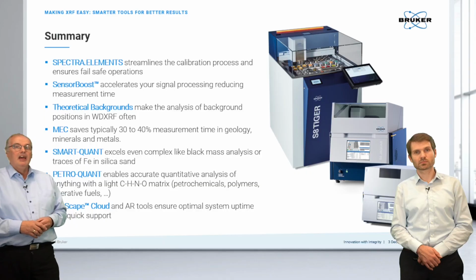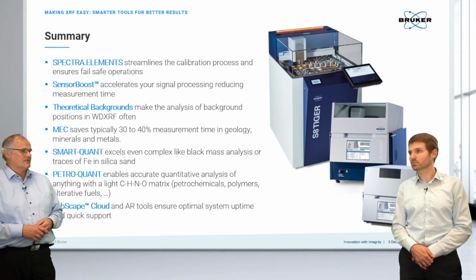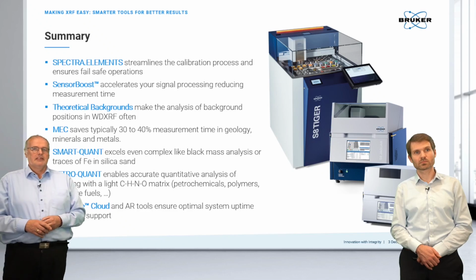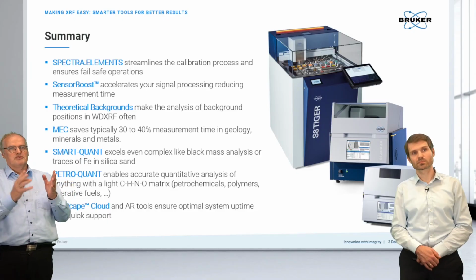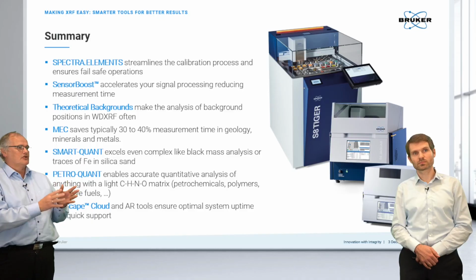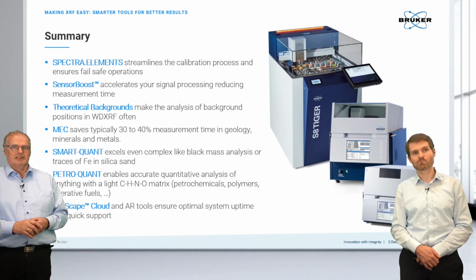The theoretical backgrounds are integrated into the software, and this again helps to speed up the wavelength dispersive instrument. This works for a lot of applications. The multi-element channel was the other choice, to go from a sequential mode into a so-called hybrid mode, having sequential wavelength dispersive and simultaneous ED measurements.